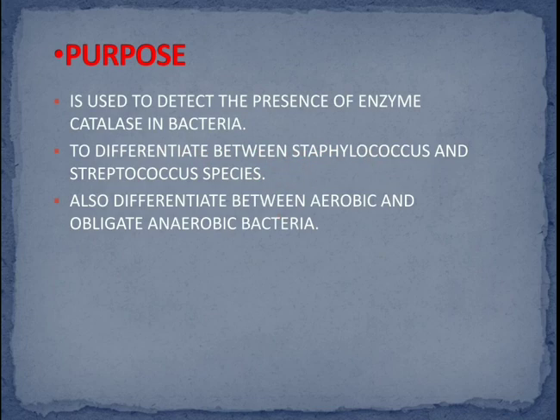Now let us see why catalase test is done. It is used to detect the presence of an enzyme, catalase, in a bacteria to differentiate between Staphylococcus and Streptococcus species. It is also used to differentiate between aerobic and obligate anaerobic bacteria.